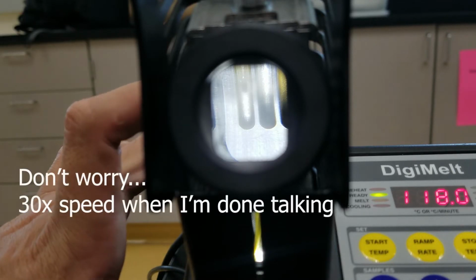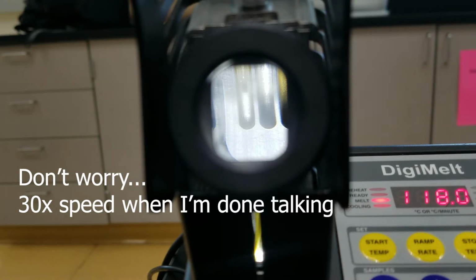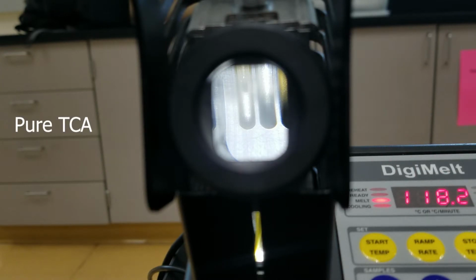All right, looks like we're ready to go. Temperature's up, sample, we can see it in the view. Let's go ahead and start. So all I did, it's out of frame right now, but I just toggled the start stop button to toggle this light over to melt. Now the part where you just hang back and wait.